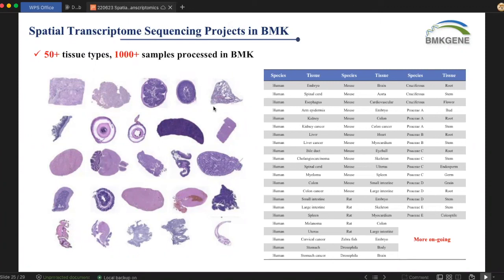I have a question regarding the combination of single cell sequencing and spatial transcriptome sequencing. Do we get both in a one-step procedure? No, actually, these are two different projects. In single cell sequencing, you need to dissociate your tissue into a single cell suspension. We do that on a separate system called 10x Genomics Chromium, where they form gel beads, capture each single cell and barcode it individually.